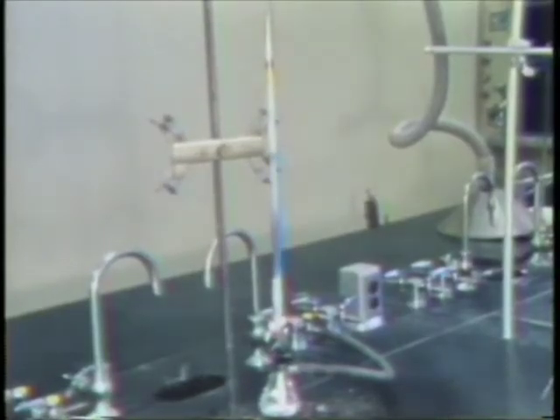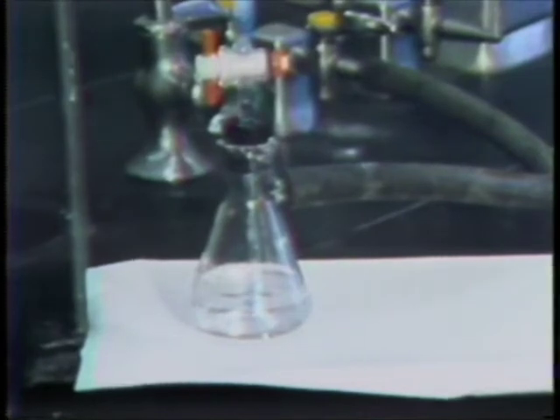As the column is continually washed with a solvent, time-lapse photography clearly shows how the blue molecules are separated from the orange molecules, as the blue substance partitions itself preferentially in the moving solvent and is collected as the solvent leaves the tube. The orange substance is still at the top of the tube and can now be recovered.